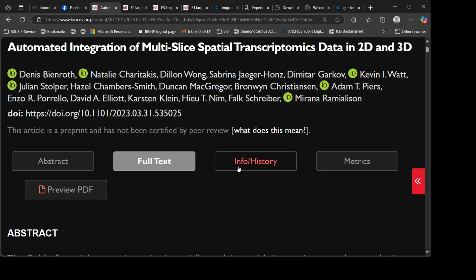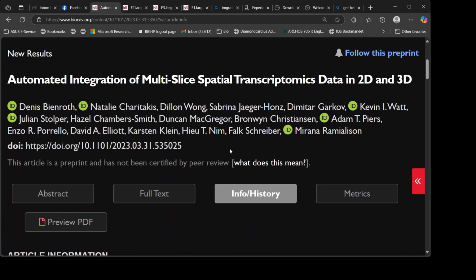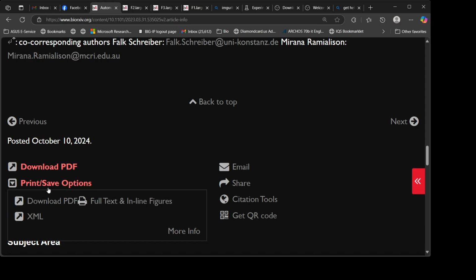Firstly, the comparative analysis underscored that most tools are tailored primarily for 2D data, with limited capabilities for integrating 2D slices into a coherent 3D structure. Accordingly, all tools compared except VR-Omics, Stitch 3D and VT3D were not able to proceed beyond completing Task 3.